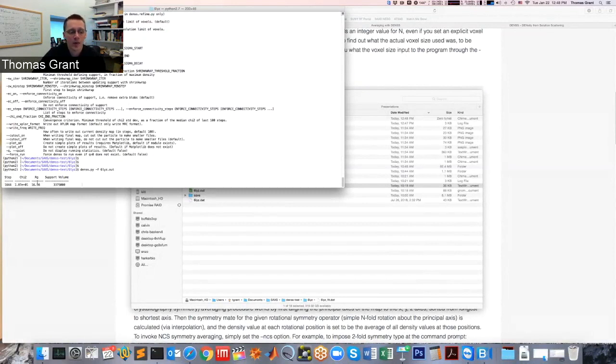One of the things to note about radius of gyration is a lot of times at the beginning of the reconstruction process, these could be some nonsensical numbers. It might start off with a negative value or something really large or something like that. And that's really just because with the Fourier transform, there's periodic boundaries and the RG calculation doesn't really understand when something floats over a side. But it recenters things and it gets more globular as it goes on.